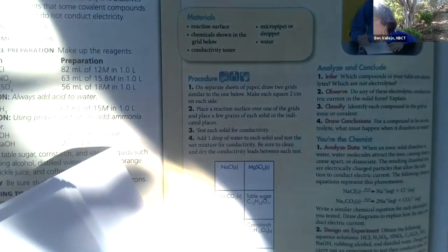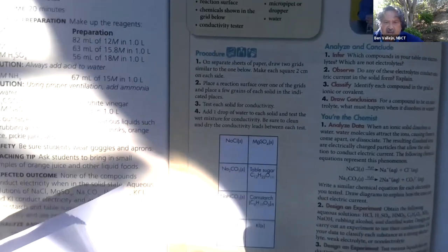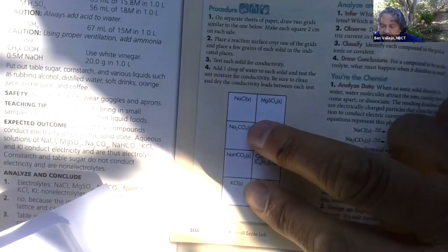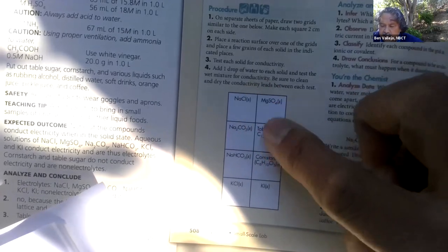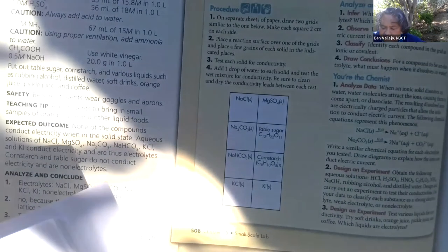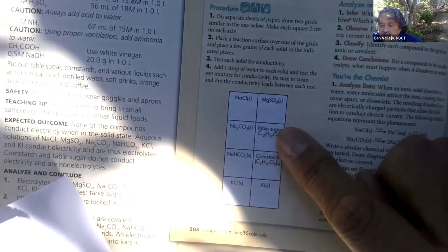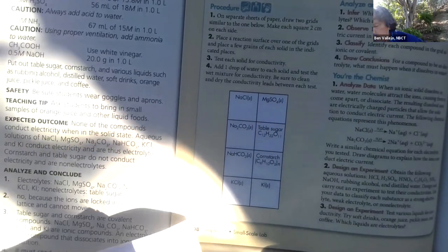The third section is the results. The results are going to be this table right here, but we saw that everything lit up. So all of these guys, we did these five, plus we did this. We didn't do these two because we didn't have them, but we did these six. All right, 1, 2, 3, 4, 5, 6. Did not do those two. So if I had a pencil, I'd put an X here and an X here. Or you can write in your book, X and X. But all of these lit up. This one, not as much as the other ones, but they did all light and show conductivity.